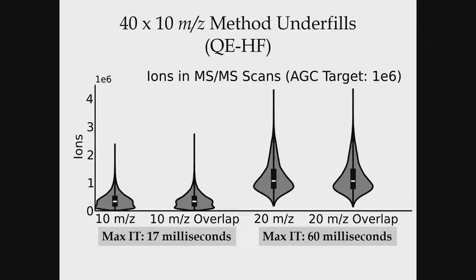So I will point out that as you get to the Lumos and the QE HFX, sometimes 17 milliseconds is actually enough. But when you go from the QE HF versus the QE Plus, it definitely is not. The source is not bright enough.